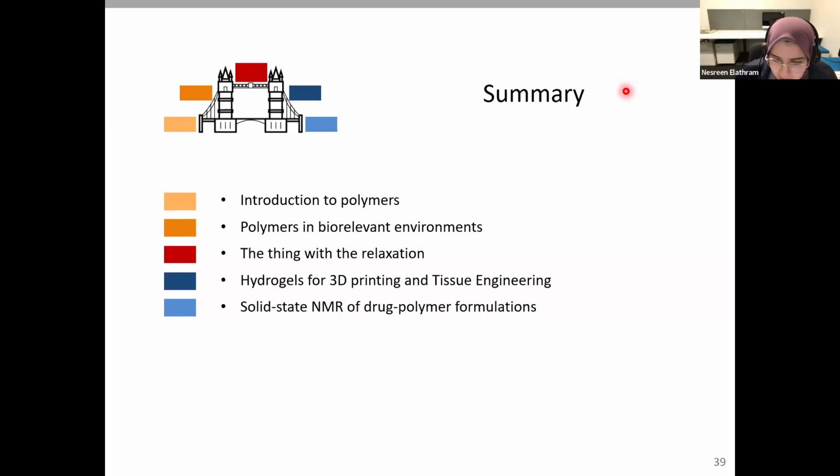Okay. And last question, from someone with little experience with DOSY. What are the important differences between a diffusion optimized probe and a conventional solution NMR probe? Okay, so there are more DOSY probes out there, but the one that we are operating with, we have one of the standard solution probes with a gradient with which we can do the normal DOSY measurements.